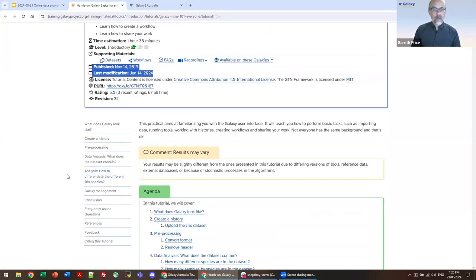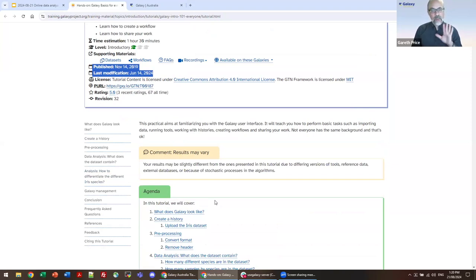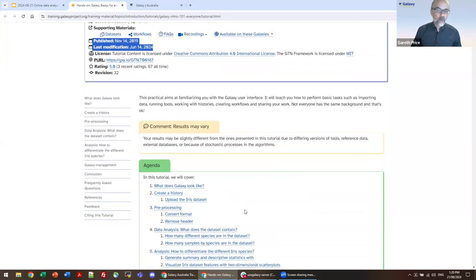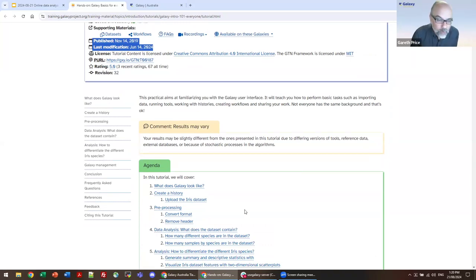So with that we're going to get started and work our way through the tutorial. Just as a reminder, this is about setting up good practice in the software. The actual data we're going to analyze — you can debate at length how exciting that data set is to you. It's a botany data set, so if you like botany hopefully you're more excited.